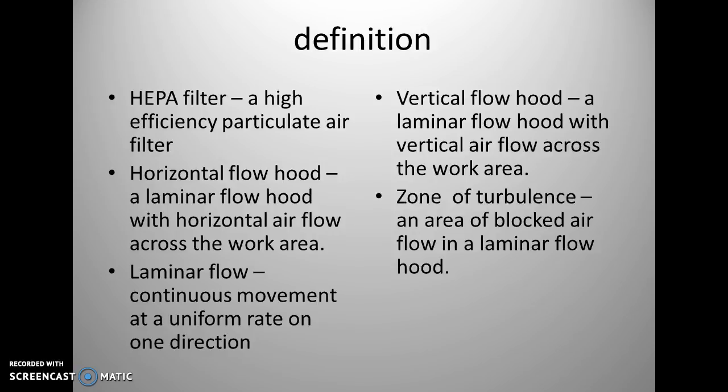And then you have zones of turbulence. The zones of turbulence are areas of blocked airflow in the laminar flow hood. And we have pictures to show each of these.